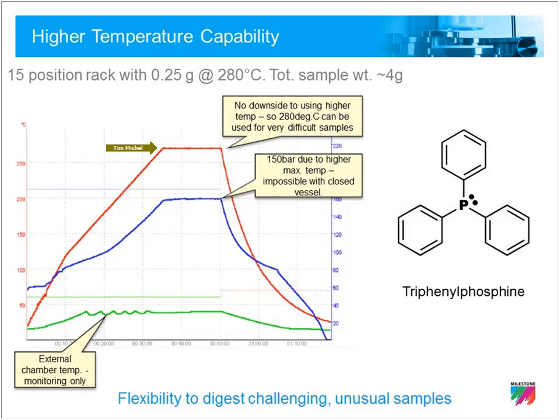Every time, at every temperature prior to that, we'd either get a milky colored solution or it would cloud up upon dilution. When that happens, it is because the organic backbone of that sample is not broken down. The same acid chemistry can be used, but the temperature must be increased to get a good digestion.